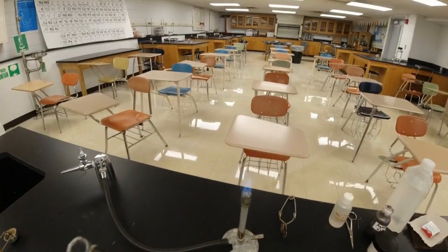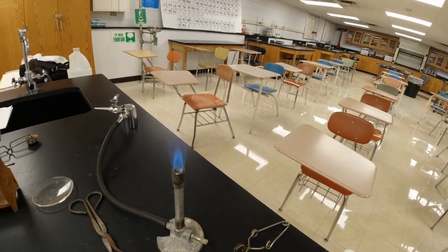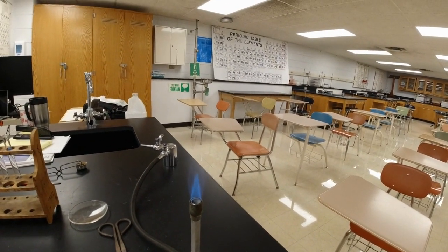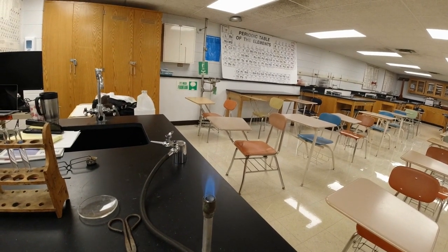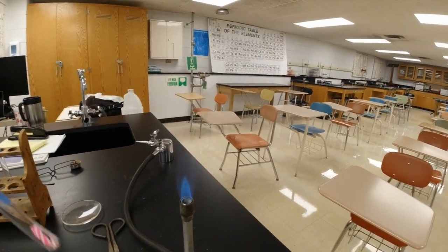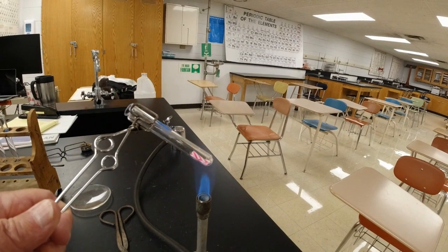All right, so I'm going to hold this up like this, move to the side a little bit. If you look at the blue flame from the side, the light blue cone that you can see pretty plain, that's where the actual mixing of the natural gas and oxygen is taking place. Just above that is the hottest part of the flame. So I'm going to hold this wax just above that hot part of the flame, and almost immediately you see the candle changing shape.